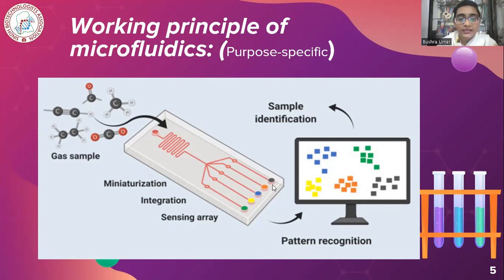The sensing array, as I mentioned in the diagram previously, is a kind of result showing device. So there must be a sensing array or a sensing device which will process and pass the integrated components to the computer.